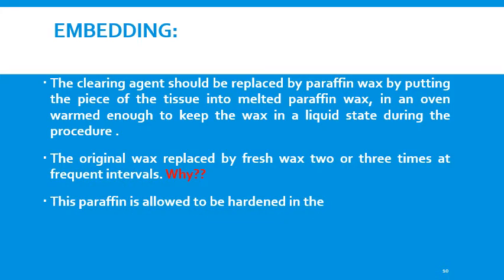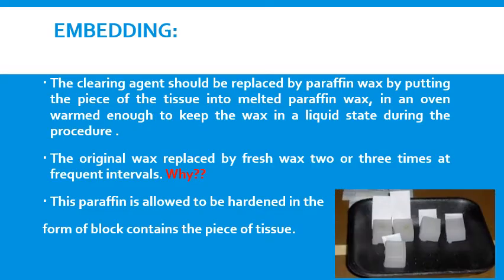This paraffin is allowed to harden in the form of a block containing the piece of tissue. This image shows the block of paraffin wax containing a piece of tissue.